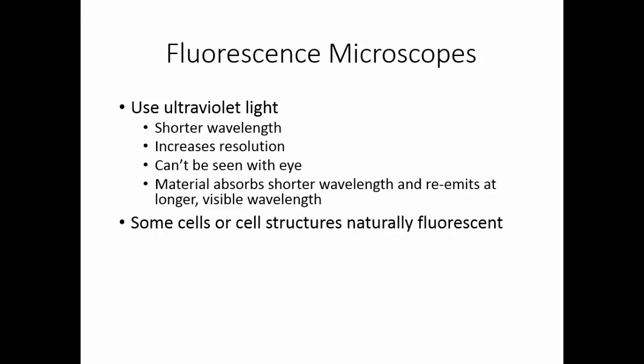Now, some cells do this naturally, and some cell structures do this naturally. Chlorophyll, for example, naturally fluoresces. If you look at it under a fluorescent microscope, you'll see chlorophyll light up beautifully.